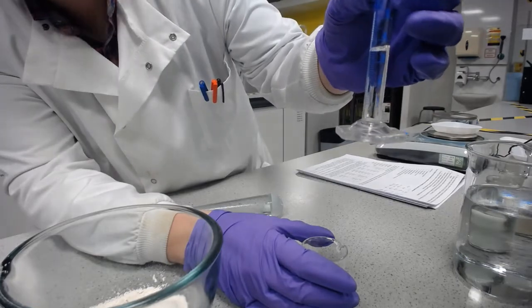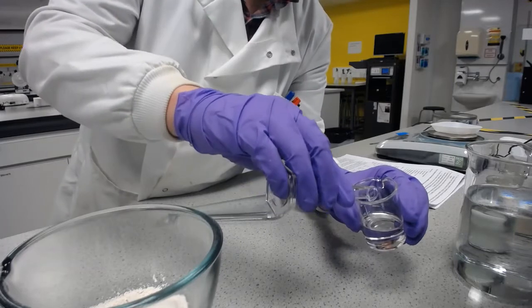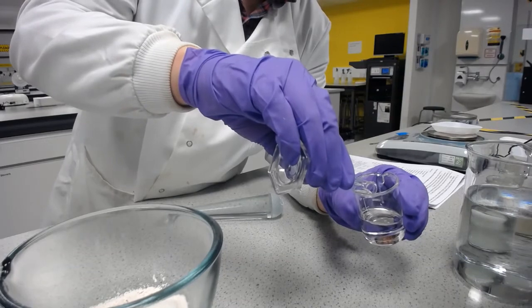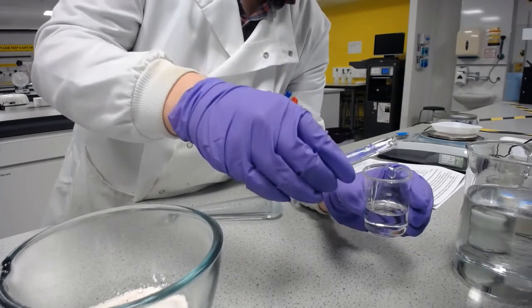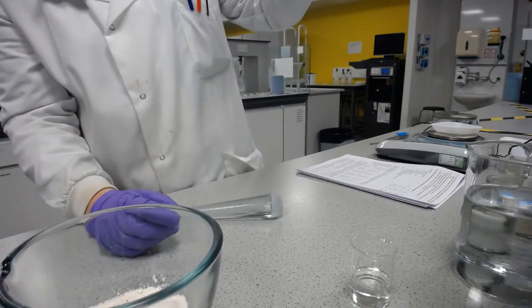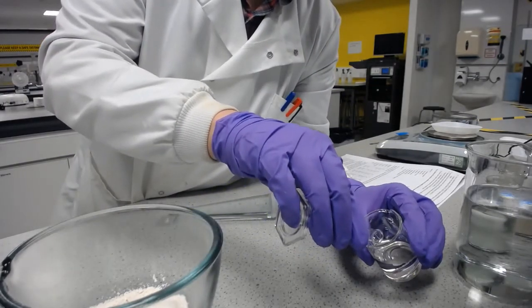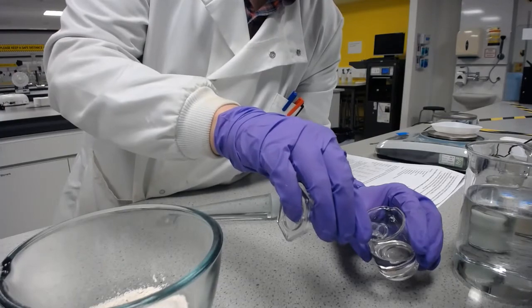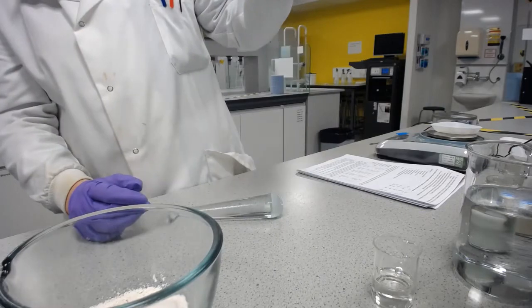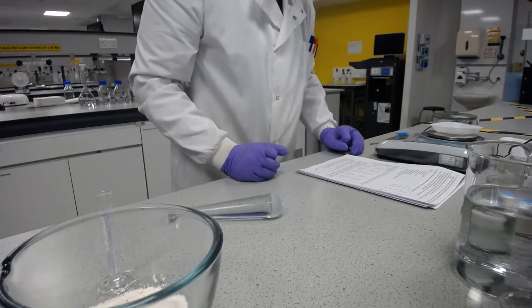Now we can see I've over poured that, but I've already decanted out and I'm not going to use this again, so I'm just going to pour a little bit of that back in here. This isn't the stock bottle, so I'm not contaminating anyone else's work. You can see it's still a little high, so I'll pour a bit more out. Now, when I pour this out into the rest of the ingredients, I'm going to use a little bit of that water, 250 millilitres, to rinse out the measuring cylinder, just to make sure I get all of the glycerin out that I need.